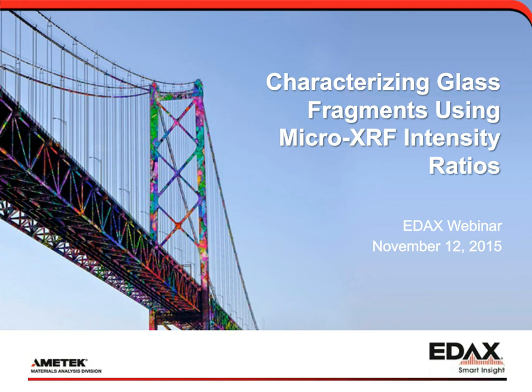Okay, thank you, Sue, for the intro. Thank you, everybody, for joining us for today's EDAX webinar. My name is Andrew Lee, the XRF Applications Engineer. And the topic I wanted to discuss today was characterizing glass fragments using micro-XRF intensity ratios.